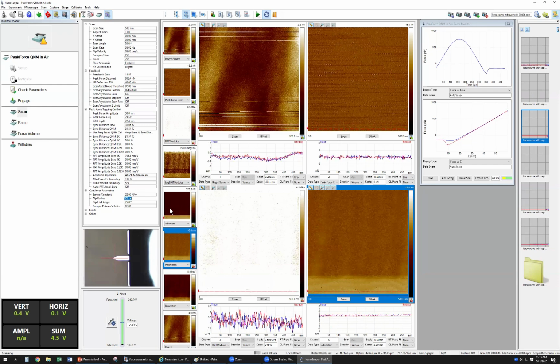2.7, right? 2.7. It's quite difficult to get the 2.7. Wow, so big. The data is so big. Yeah, the value is a little bit funny, right? But it depends, because the sample you already changed something, we don't know, right? Because the sample is inside the box a long time or something.